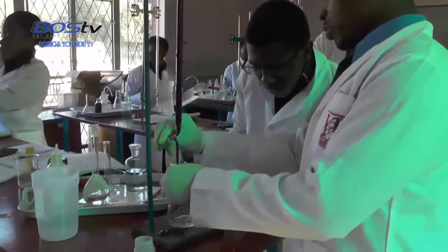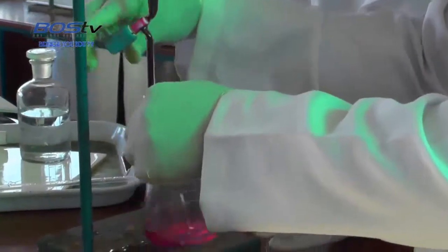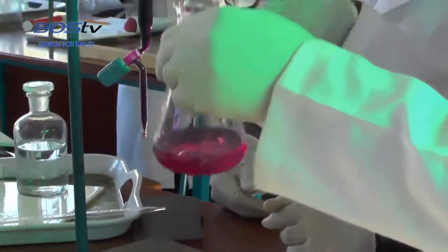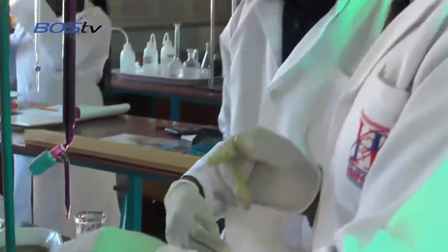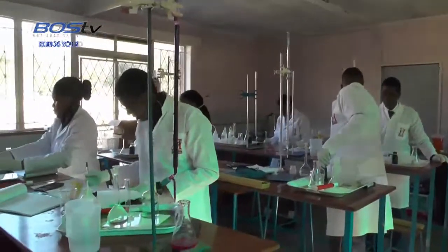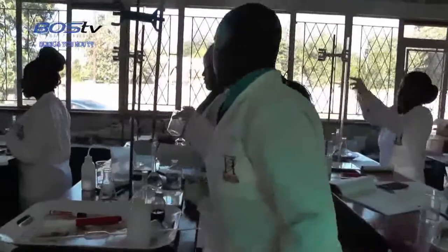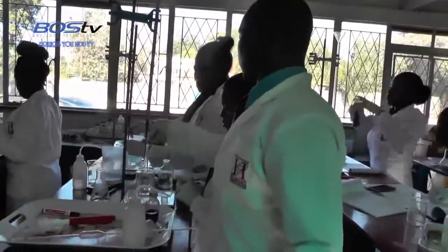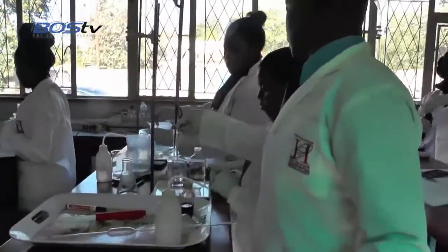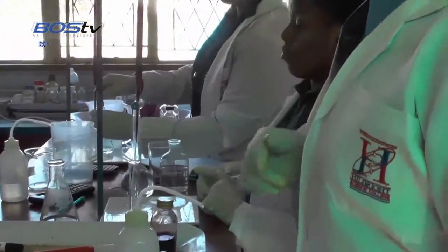As long as it's dissolved in the flask, the end point has not been reached. So this can be a rough titre, and then from that, do 3 more accurate titres. Then read your mark and start the titre. First, do a rough titre.